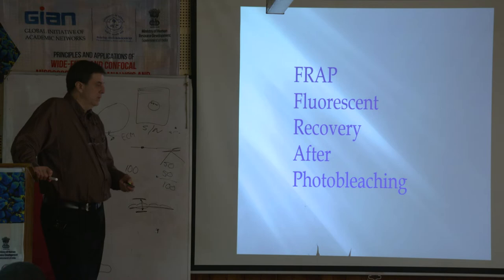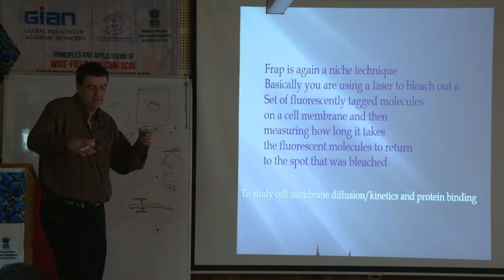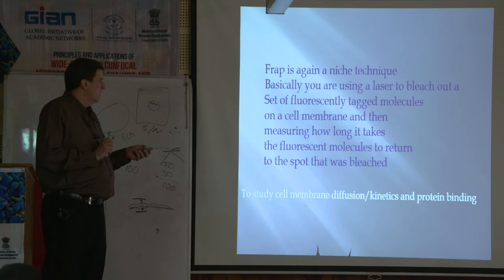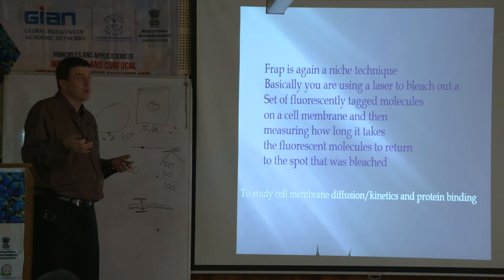Okay. So again, FRAP's a technique to study fluorescently tagged molecules on a cell membrane. A lot of times for kinetics, like you want to see how fast things are moving in a cell membrane. It's like a kinetic kind of study. So again, very niche, sort of a narrow window, but again, just want to expose you to these things so you know about them. If you end up studying something like this, then you go, maybe I should use FRAP.